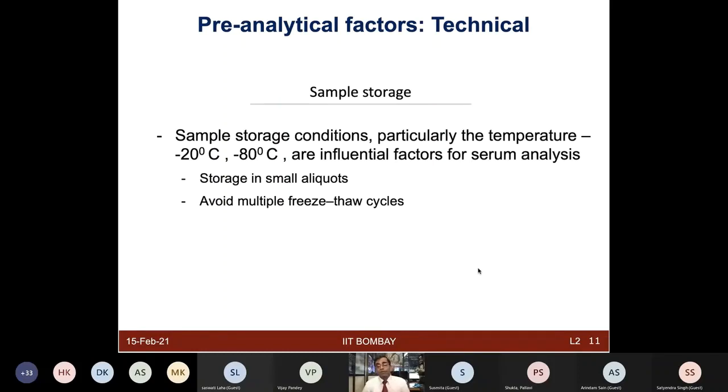And all of those are a way to actually ensure that there is no analytical variability, and you are trying to normalize those, you are trying to combat those types of variability. But how are you going to change these things? Like, think about some serum samples that some technicians have collected and kept at room temperature for 5-6 hours, which is very common. And some samples were immediately kept at 4 degrees, some samples were kept at -20.